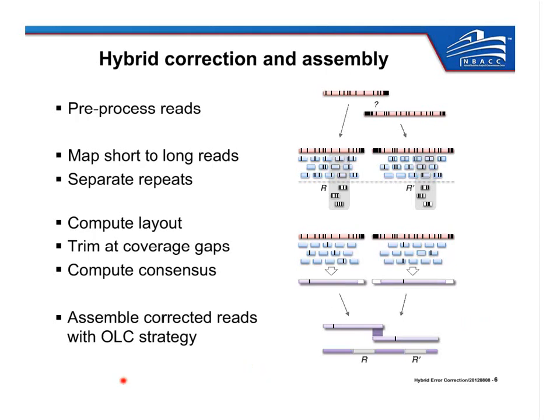Typically, what we'll show in our results is that after the correction, we're feeding those corrected reads into the Celera assembler, which uses an overlap, layout, and consensus assembly strategy, and we'll be reporting on the results of that assembly process. The output of these reads in our experiments is always about 99.9% accurate or greater. And the coverage that you miss, the length of the reads, is not shortened by a terrible deal. But if there are a number of very inaccurate reads, they could be excluded by the pipeline. So maybe not all of your reads will get corrected by the pipeline, but the ones that are corrected and output will be very highly accurate.